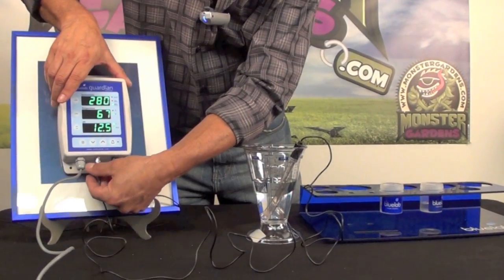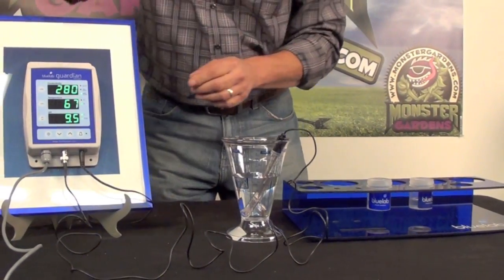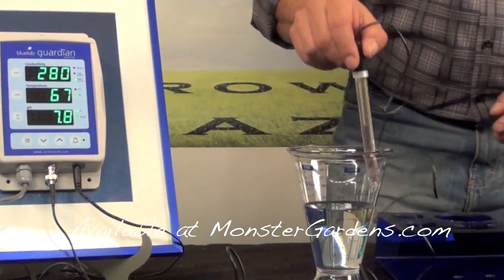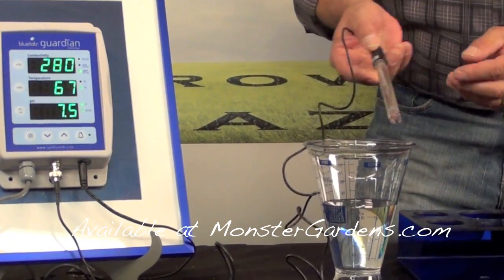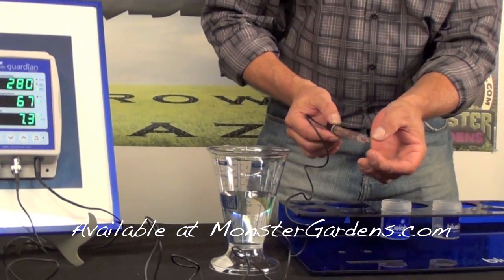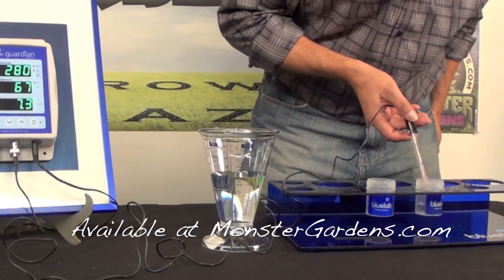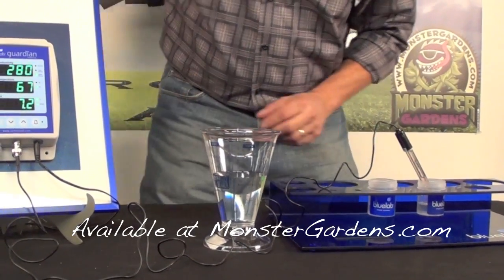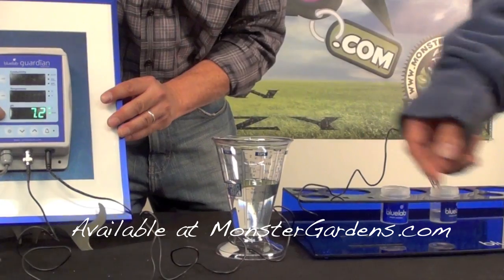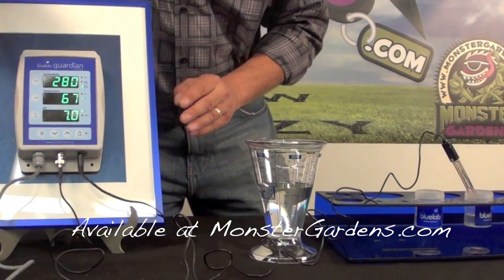Obviously when you change your probes and connectors, you need to calibrate all the time. So it's connected right now to calibrate Blue Lab instruments — very simple procedure. Here's your pH probe. It measures the ionic pressure in your solution. You put it into the seven and push the pH button, then let go. You have the seven.